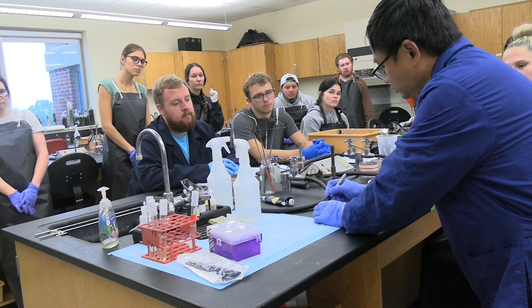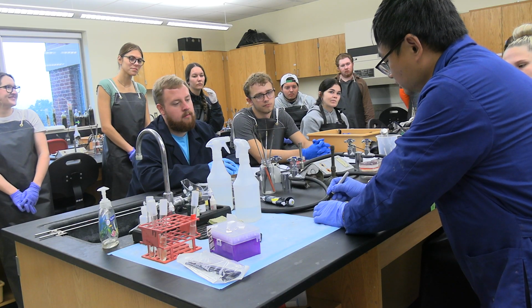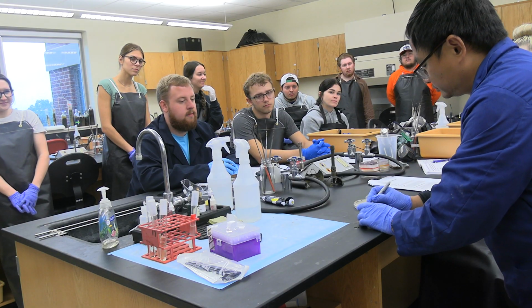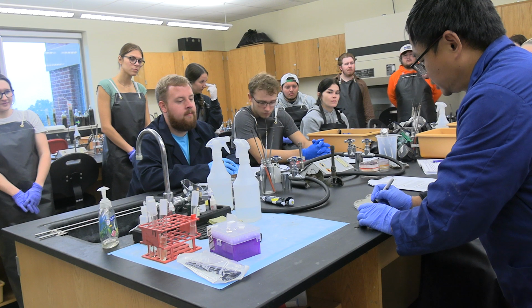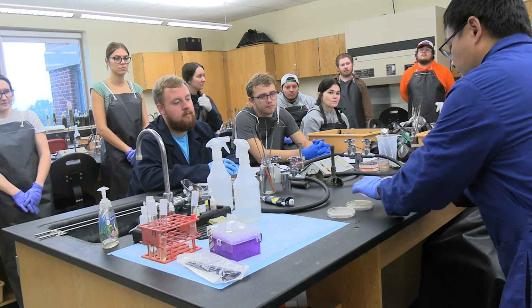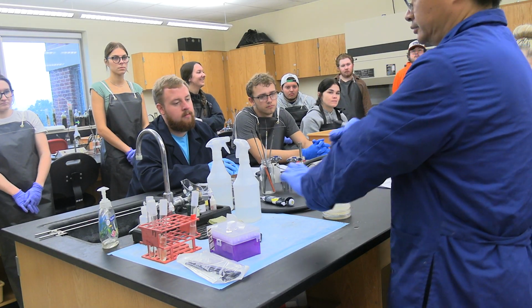And the second one, we're going to do the same. See, it's already wet, still wet. So 10 to the power of 5. And then the last one, same thing, but dilution factor is 10 to the power of 7. Then stack like this, and then you can flip it over.